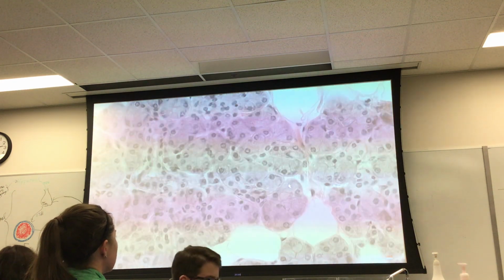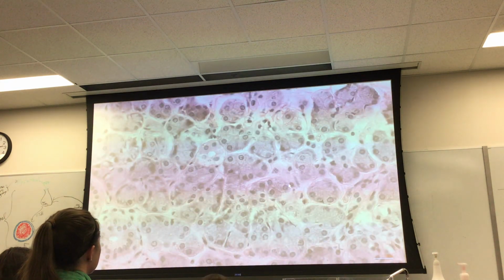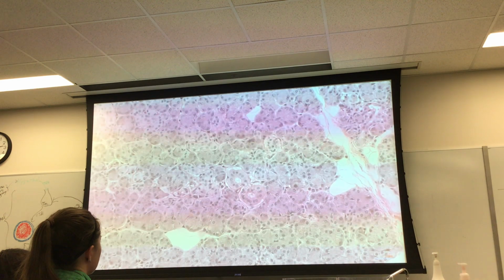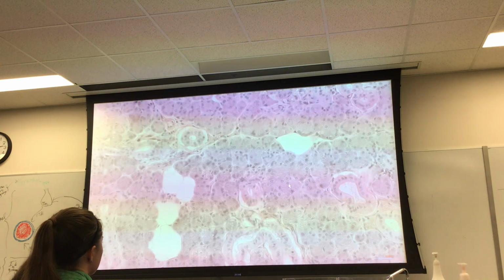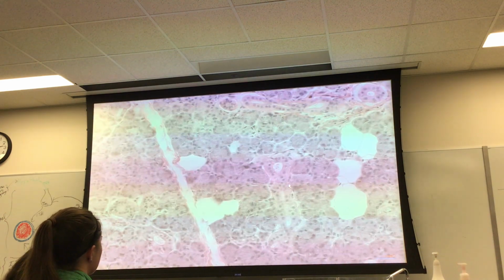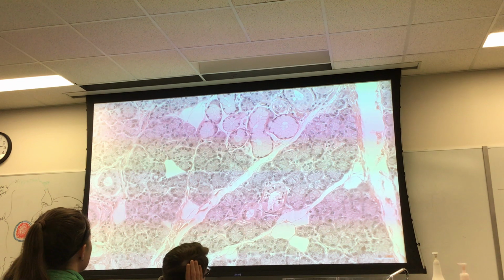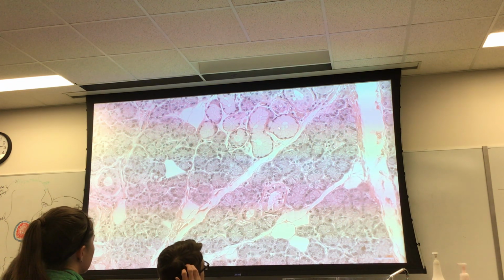But as we look around here, we're also going to see an occasional one of these, which is a mucous acinus.